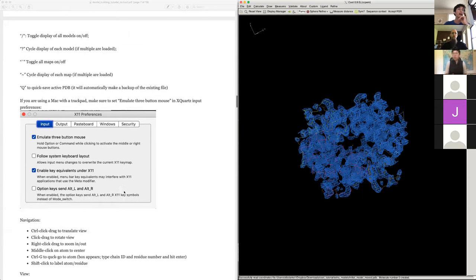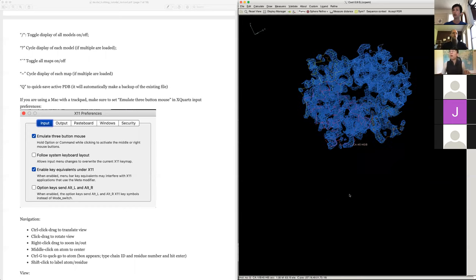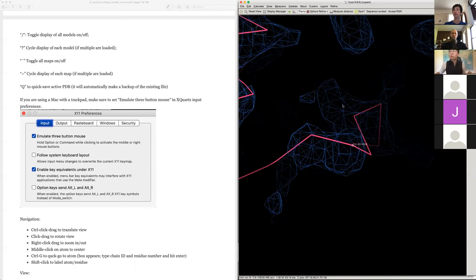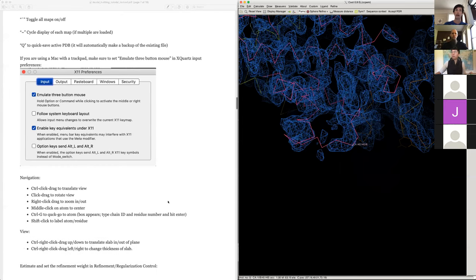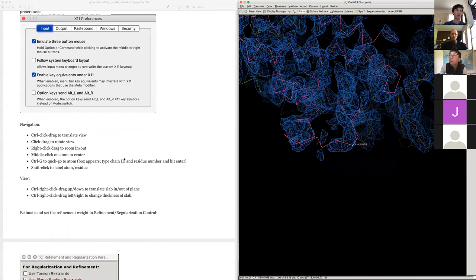If you're on a Mac and haven't used Coot much before, I'd highly recommend going to Preferences in XQuartz and changing the setting to 'emulate three-button mouse'. That means Option+left-click will emulate the middle button on a Linux system, allowing you to correctly center on an atom.